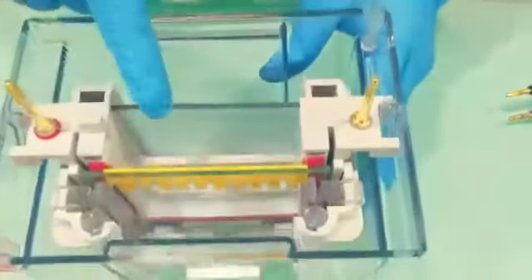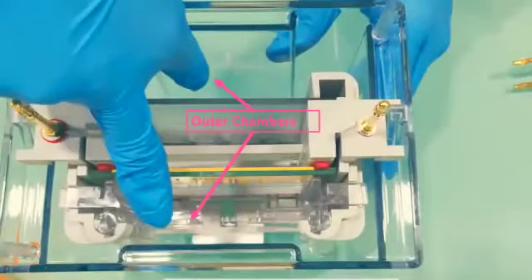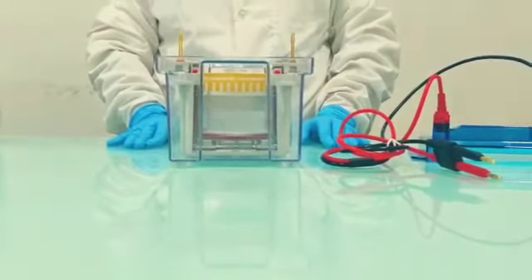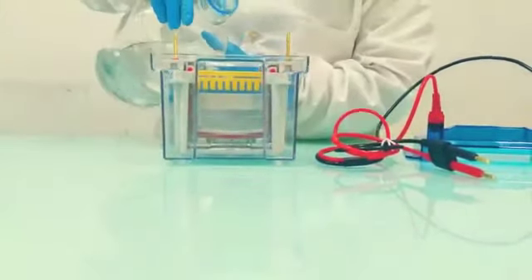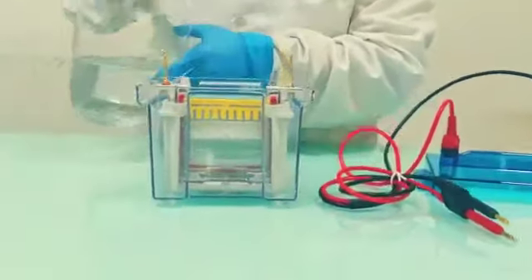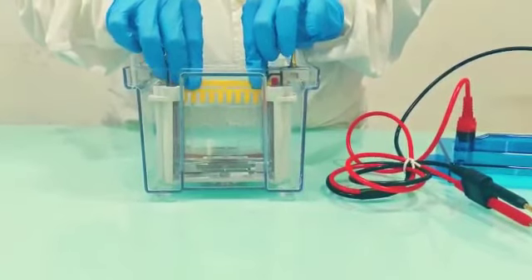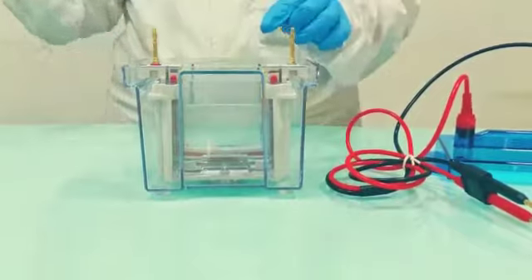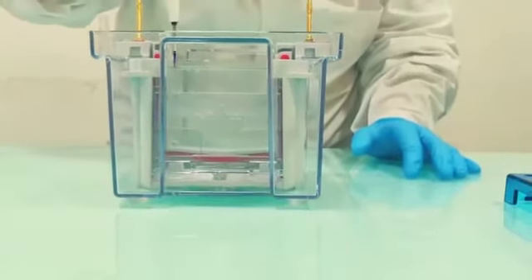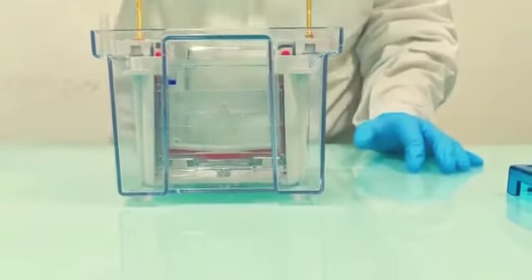And this is the inner chamber, and these two are the outer chambers. Now fill the inner chamber with buffer to the top. Now, you can easily remove the combs as it is lubricated. We will proceed with loading samples. You can also use the gel loading guide to load samples.